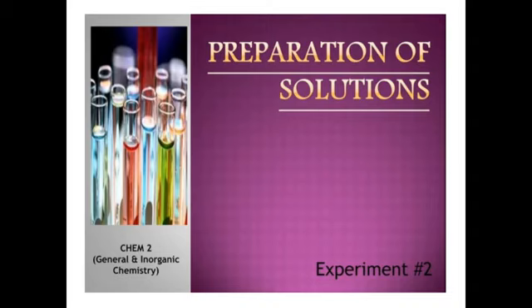And in today's class, we are going to be looking at preparation of solution, specifically how to prepare standard solution.